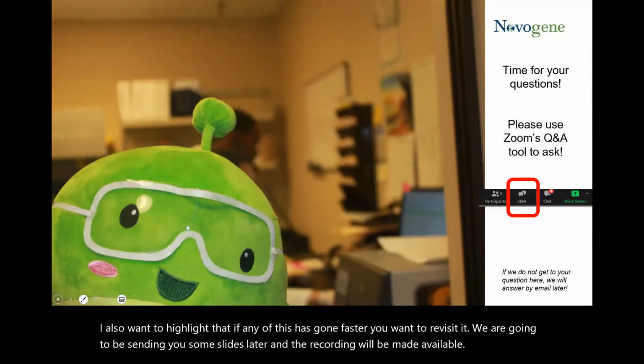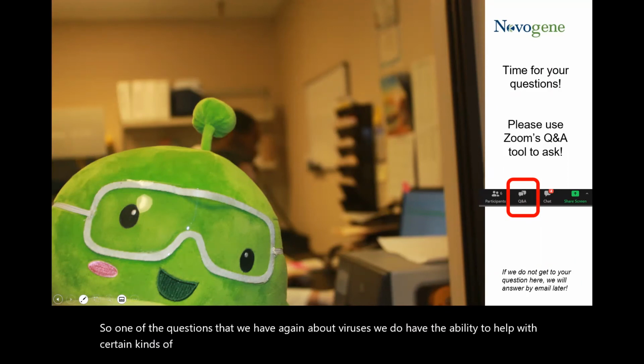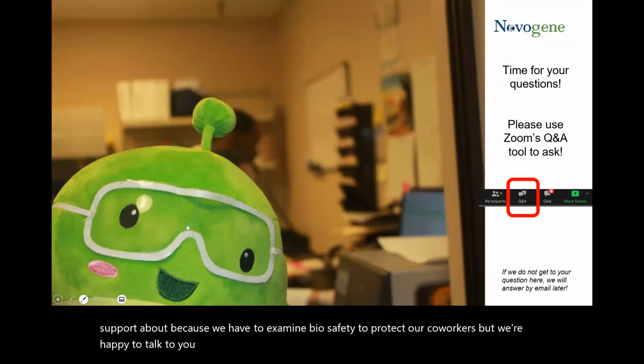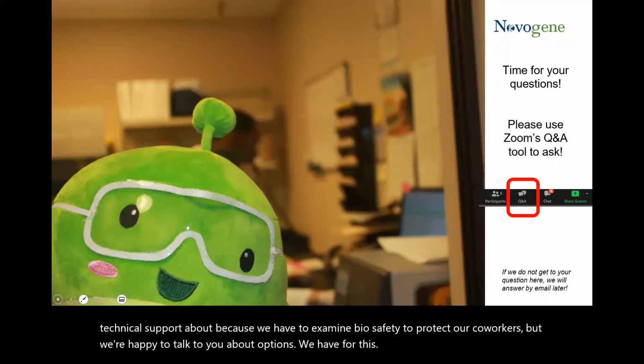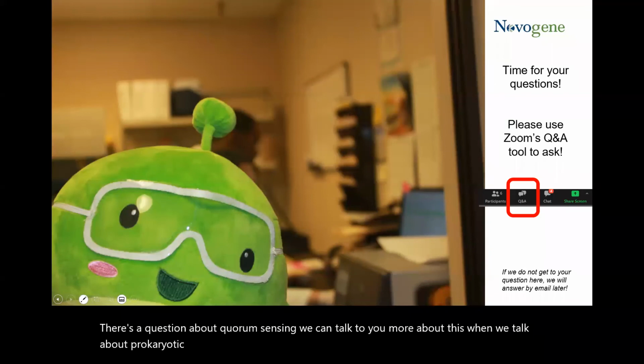So one of the questions that we have, again, about viruses, we do have the ability to help with certain kinds of projects, but this is the kind of question we want to have you talk to technical support about, because we have to examine biosafety to protect our coworkers, but we're happy to talk to you about options we have for this. There's a question about quorum sensing. We can talk to you more about this when we talk about prokaryotic mRNA-Seq. We do offer this as a separate product type.